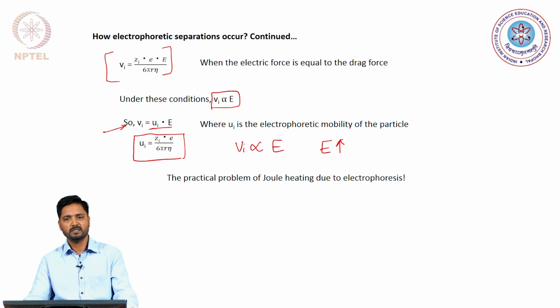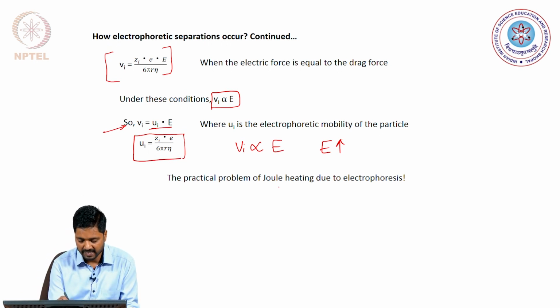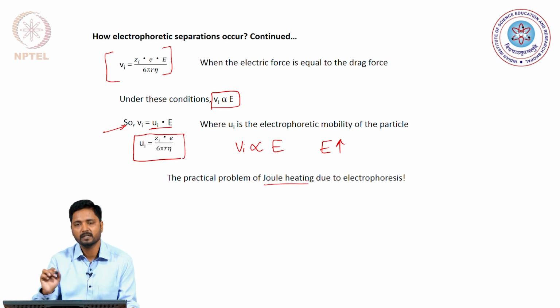Now, this brings us to an important problem that is often encountered during electrophoresis, and that is known as Joule heating.